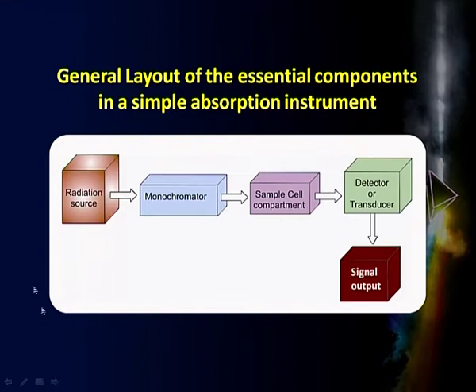That means, as I just mentioned, we have to have a source, and the source is typically a polychromatic source. That means radiations of different wavelengths are coming simultaneously from the source. Then, since I want to talk about the interaction of radiation of a given type or wavelength with matter, I want to record some kind of a spectrum. You remember that a spectrum essentially is a spread of interaction of different wavelengths or frequencies.